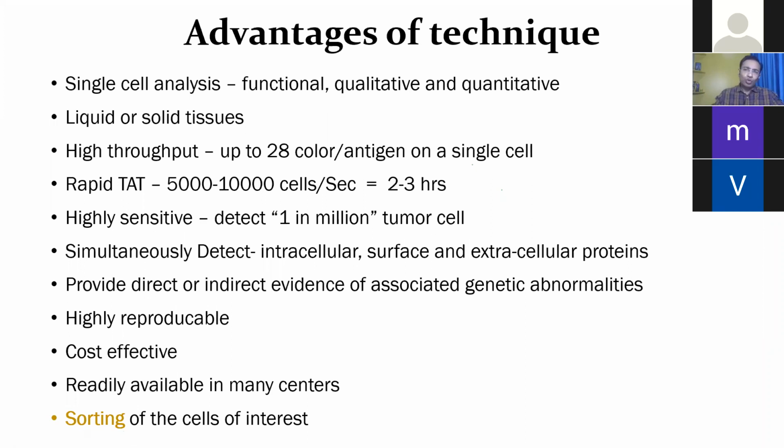Okay, when I say 2 to 3 hours, you will say, then why do we get results after 2-3 days? The reason is, if you have a lot of samples and a lot of cases, then you have to look at all of them and collect the reports together. That's why sometimes you have to put additional markers to characterize properly, and so it takes time that way. But if you want to give a single report, a straightforward case, you can give the report in 2-3 hours.